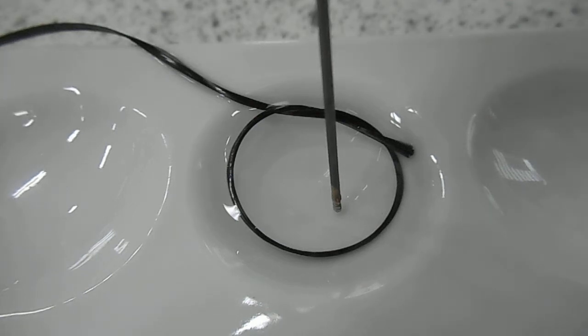The electrolysis of lead 2 nitrate solution on the micro scale. Again we've got a carbon fiber anode running around the outside and a graphite pencil lead cathode in the center, all connected to a 12 volt DC power supply.